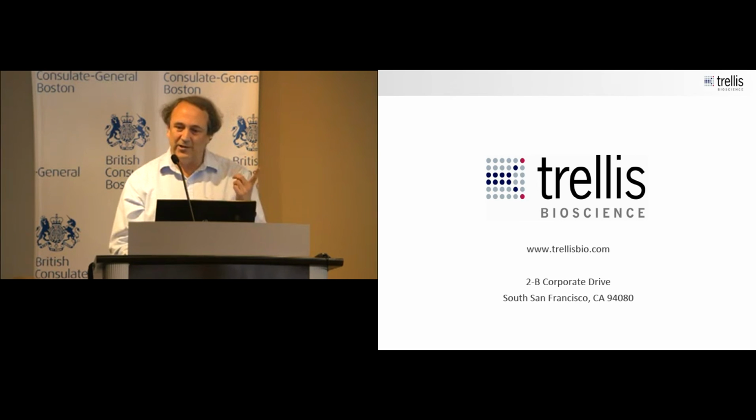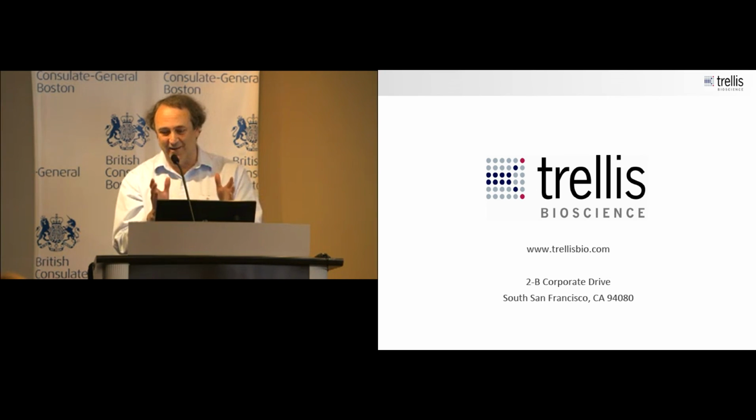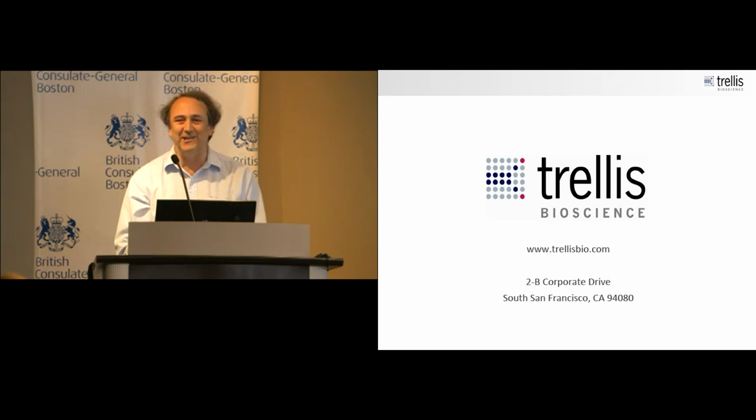Yeah. One question that often comes up is, can we do the same thing with monkey blood? And we thought it would be easy until we tried it, but macaque B cells, if there are people who know how to grow macaque B cells better than we do, they're much more fragile, and we needed a different cytokine cocktail, and even so, we have much greater difficulty cloning antibodies from macaque. So, yeah.